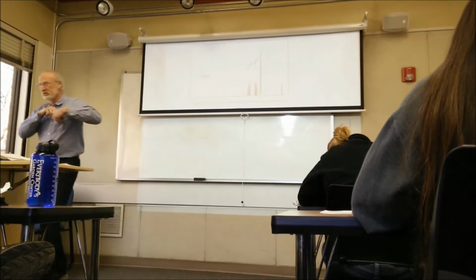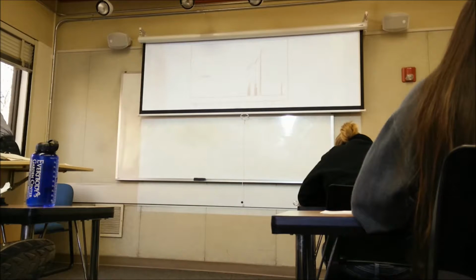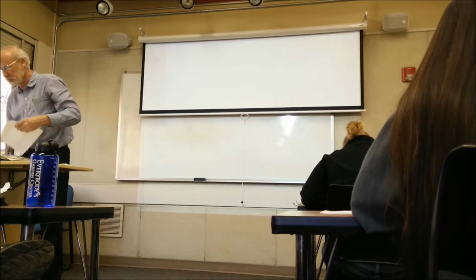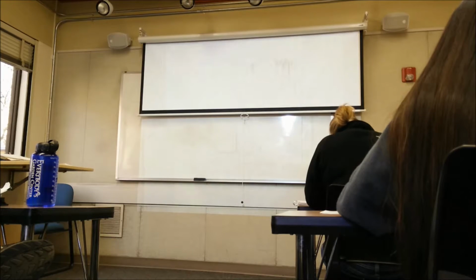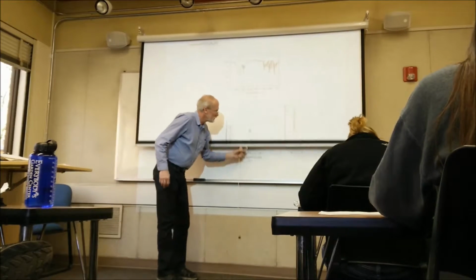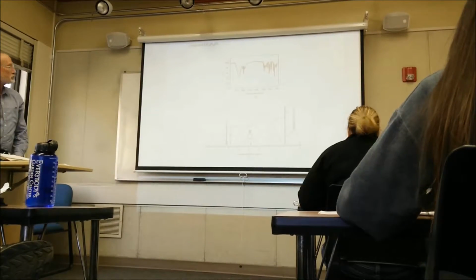The shifts aren't good for determining what it is. Right. It's better to start from big peaks with nothing else on them, and look for something splitting it. Yeah, something splitting. Here is compound 1. So this is huge. But it's like saying, oh, okay, well, there's two neighbors. But there's one.